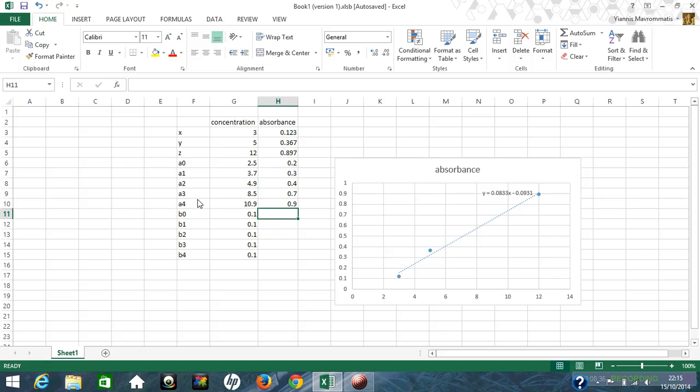So then it's up to you to take these numbers with the concentration and make a separate graph with your A's and B's and just demonstrate the difference between the two patients in terms of insulin and glucose response. Okay, I hope this clarifies things a bit.